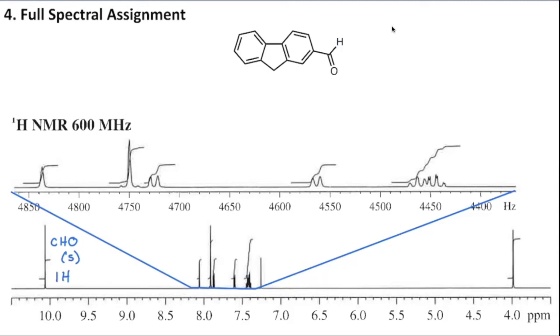Okay, on the other end of our hydrogen spectrum, we have something a bit lower at about 4 ppm. Everything else is in that kind of 7 to 8 range. So what could be at 4 ppm? When we talk about signals in the upfield region, we think mostly about alkane chains, totally saturated CH single bonding motifs. I don't want to say nothing interesting, but the less interesting functional groups that are mostly based on carbon and hydrogen and don't have a lot going on nearby.